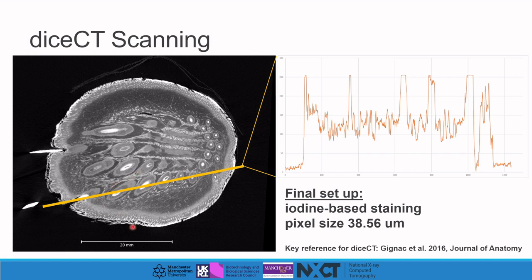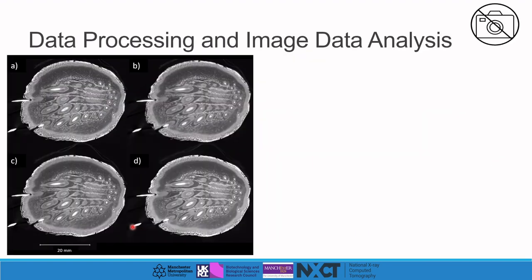So to improve the shape and texture contrast we can see by eye, so that we can digitally segment the data, we still want to reduce the noise further and smooth the grayscale values while preserving the edges of the shapes. As a result, we tested a number of image filters on the data, and the final filter we chose was a non-local means filter, which preserved the edges of features while smoothing noise.